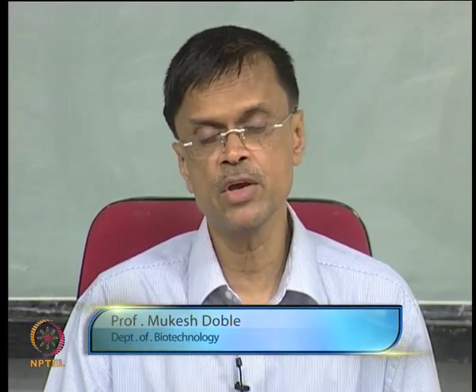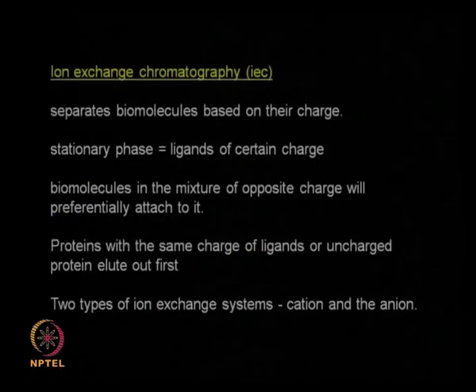So a combination of anion cation exchange chromatography can help you to separate sodium chloride or any other salt from protein. So you will get pure protein and you can remove all the salt. So ion exchange chromatography is very good for biomolecules based on the charge.